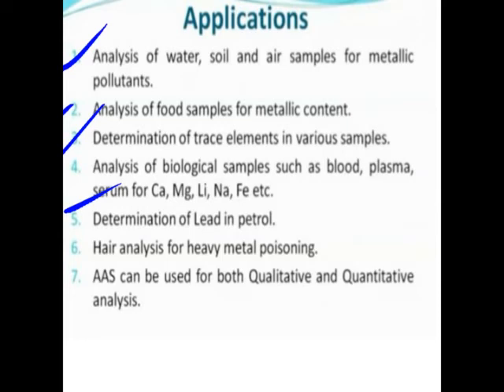Then in petrol, lead is present. To determine the lead in petrol, we can go for atomic absorption spectroscopy, to find out whether it is present and in what amount. Then analysis of hair for heavy metal poisoning can also be done. It is used for both qualitative and quantitative analysis. So these are the applications of atomic absorption spectroscopy.